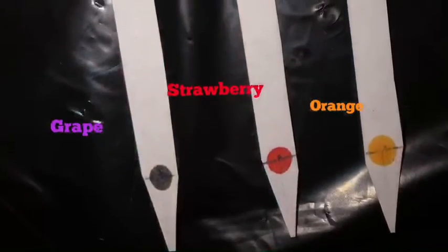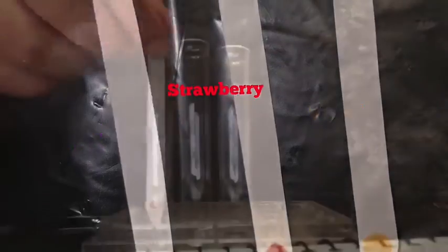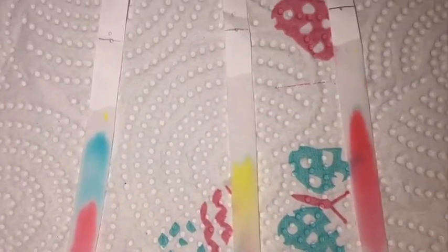The same procedure was repeated but with different colored compounds of Kool-Aid. You can see the mobile phase travel through the stationary phase, separating the compounds with it, also where different components of the compound stop absorbing.